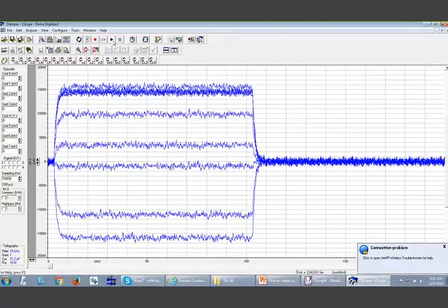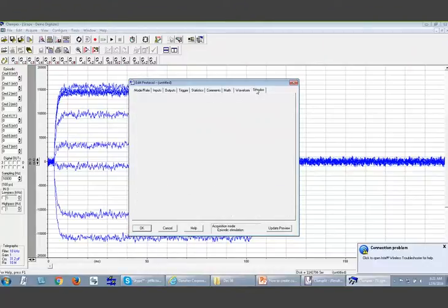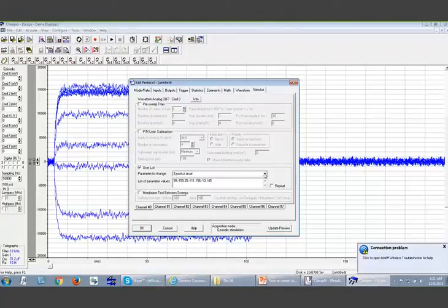All right. So I showed you how to change the holding level. Now let me show you another example of how I can change the first duration. Let me go back to here, to the epoch 8 duration. Now you can put any number here. I want to show you that for the time there's no minus, so I just delete the minus.